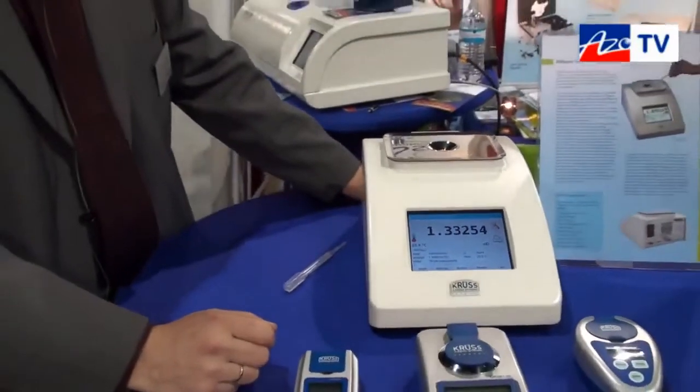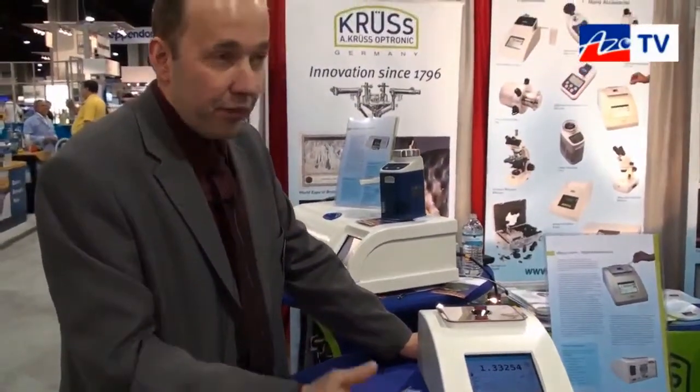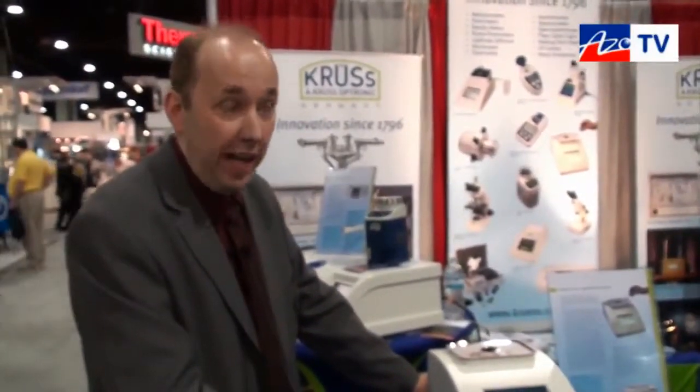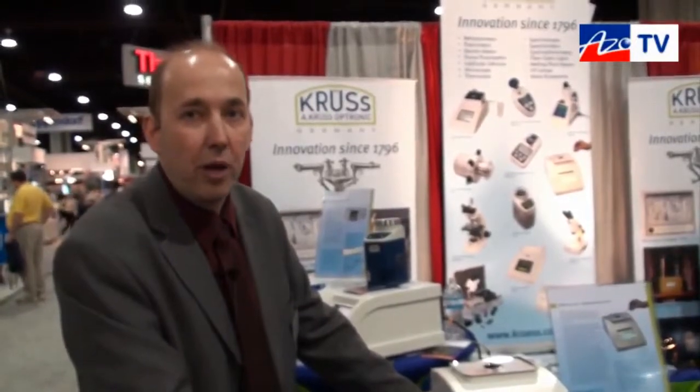Stefan, what range does it measure? What's the refractive index range? We have two different ranges: 1.32 up to 1.58, and 1.7 is the other range. Most liquids fall within 1.58, so that's normally no problem.